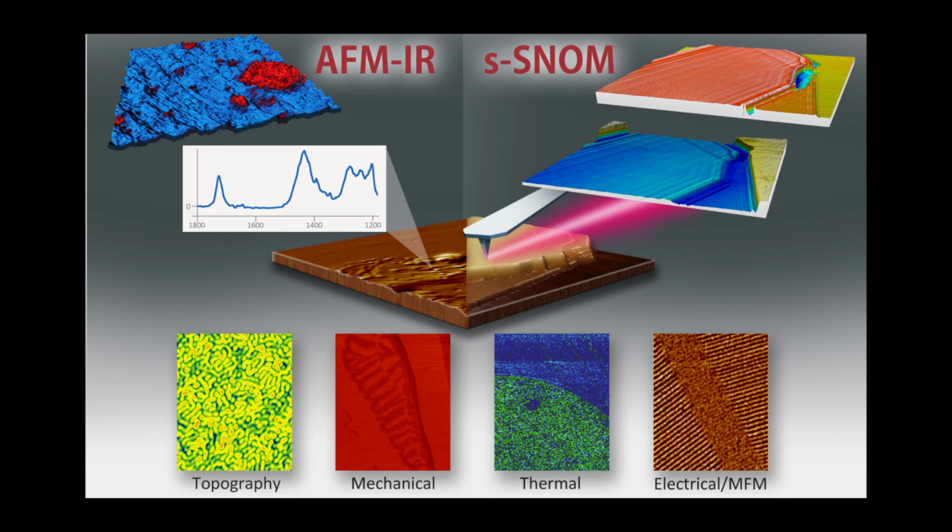Okay, we had a question that said, could we comment more on the resolution of the technique? Is there a convolution between the sample and the tip? So this question is about spatial resolution, and the spatial resolution is limited by one of two things. In especially the previous technique, before the resonance enhanced technique, the spatial resolution could be limited by thermal diffusion, basically the spreading of heat from the point where the IR light was absorbed.